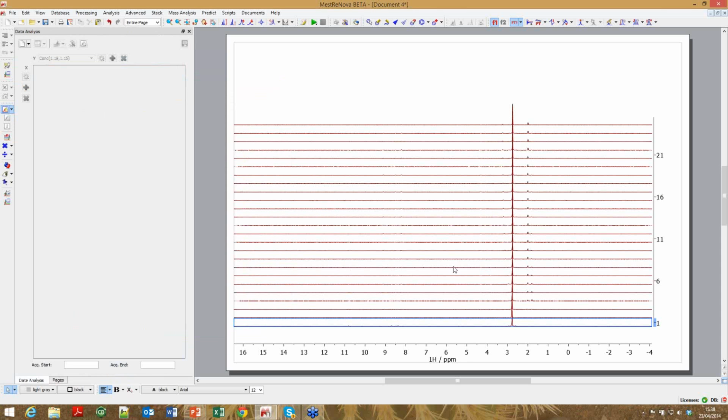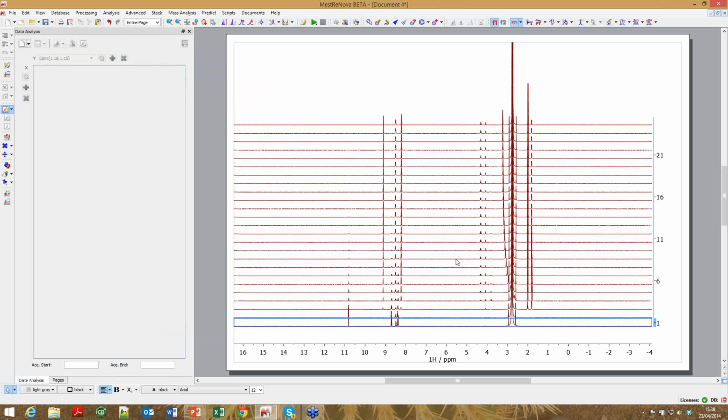So what we've got here is a bit more of a real life situation where someone's done an experiment in a reaction vessel. And so the first couple of time points are a bit rubbish. You can see there's odd things happening there, so we're going to have to do a bit of extra work here. So let's get into the situation where we can work with this. There's a peak over here which I'm going to take as my starting concentration. So I want a concentration graph.